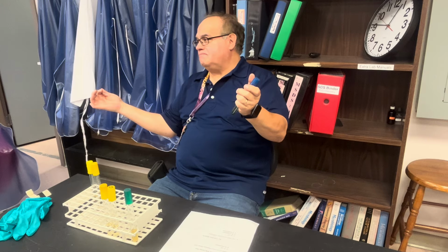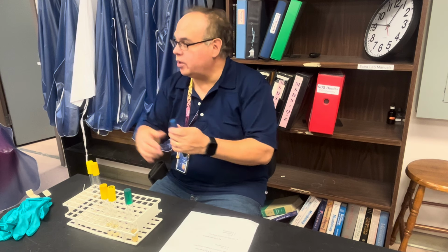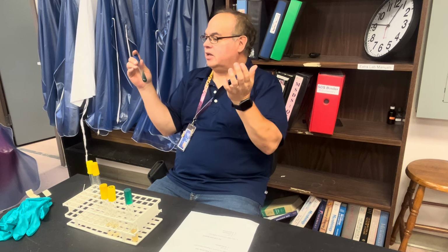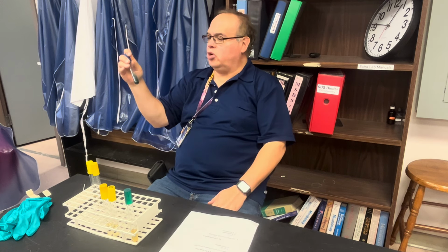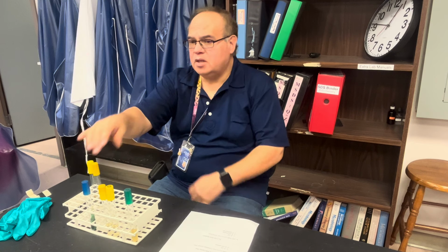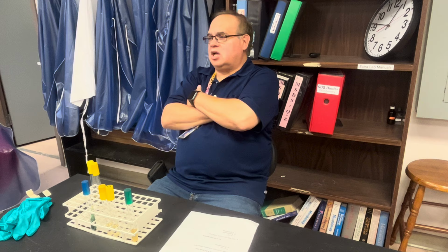Okay? Any questions? You'll come back in 48 hours Thursday, and you don't have to do anything else to this one. All you gotta do is look at it. If it's green, it's negative, or yellow, it's negative. But if it turns blue, it's positive. Because when the organisms break apart citrate, they release ammonia into the environment.